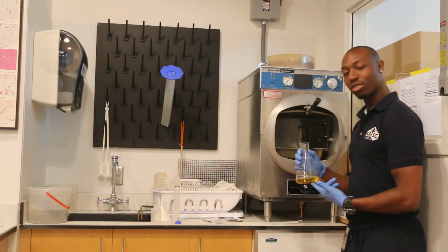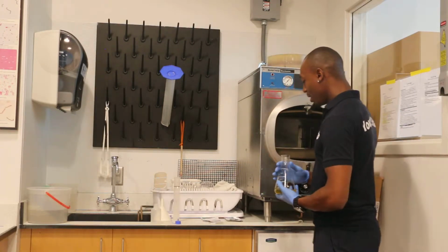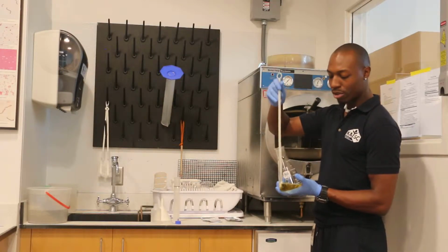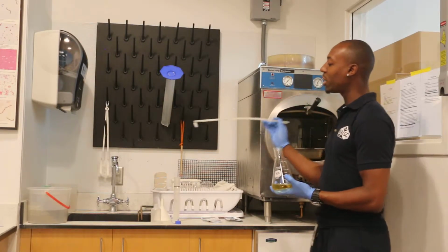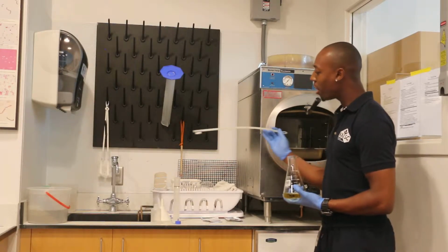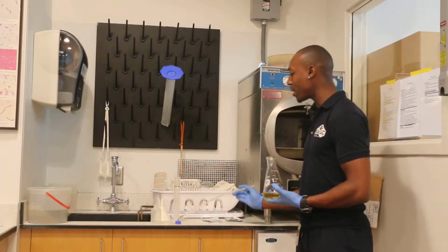All right, so I've dissolved my powder. Awesome, okay? What I want to do is use my magnetic retriever to get the bar out, okay? At this point, I'll usually just hold this right now and I'll wash this off. And I want the bar to be sitting right over here in the drying rack, okay?